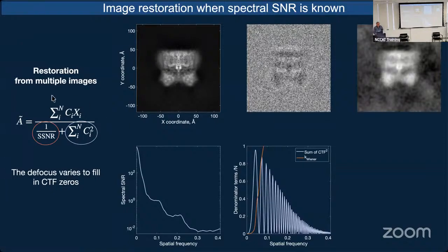So I want to show you what's happening under the hood with this operation. So this is the Wiener filter. We're adding together CTF times the image. We're adding those together. We're dividing by CTF squared, and we have this. And all of this is done in the Fourier domain because we're using the fact that you operate with the CTF by just multiplying the CTF by something.